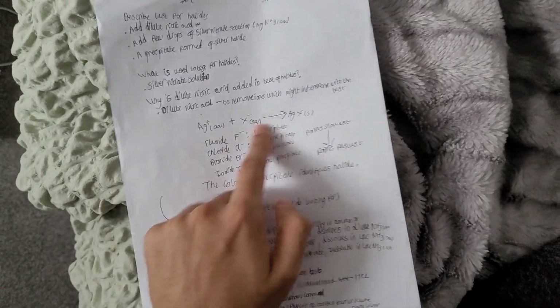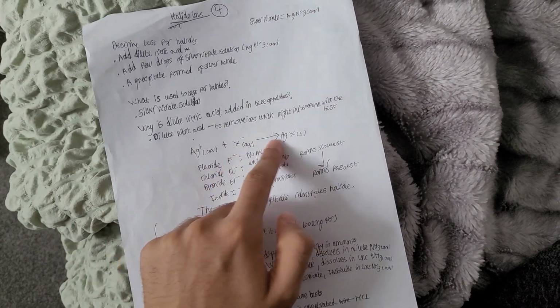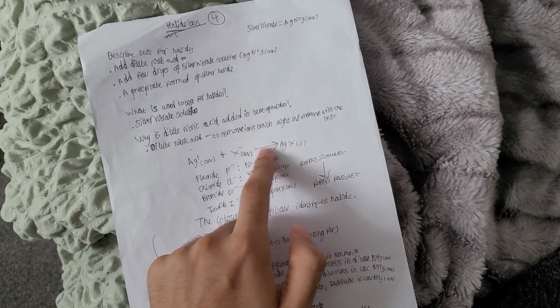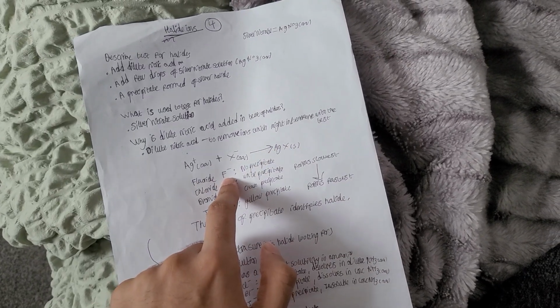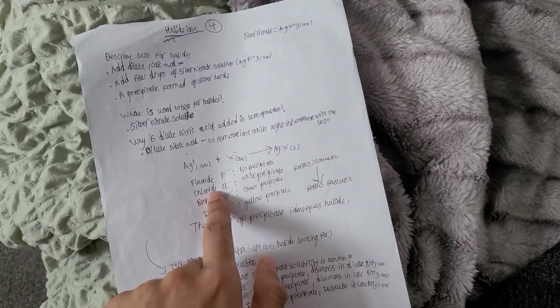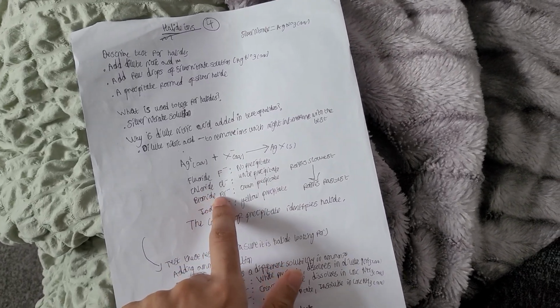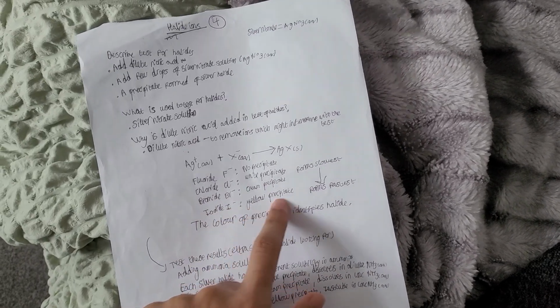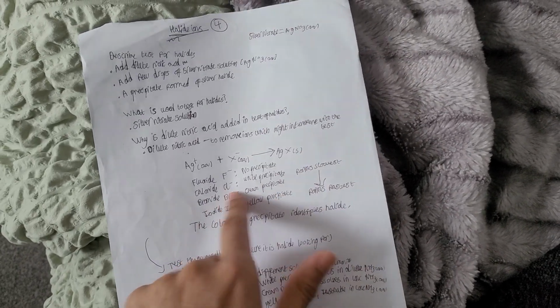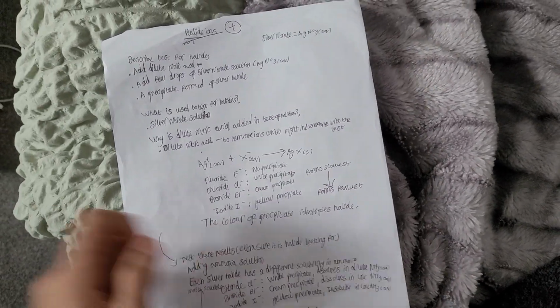So it's a basic equation: Ag+ aqueous plus X- aqueous to form your silver halide, AgX solid. You can see the fluoride ion F- has no precipitate. The chloride ion Cl- gives a white precipitate. The bromide ion Br- gives a cream precipitate. The iodide ion I- gives a yellow precipitate. Forms slowest to forms fastest. The color of the precipitate identifies the halide.